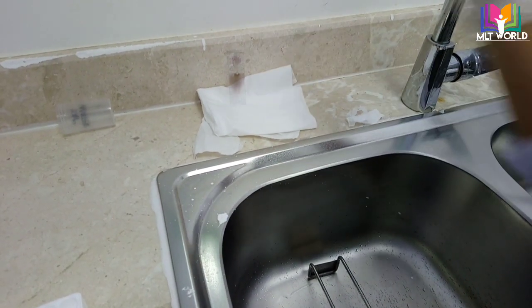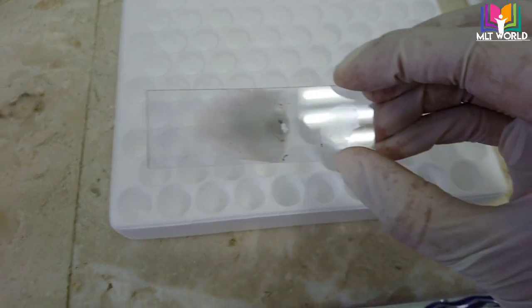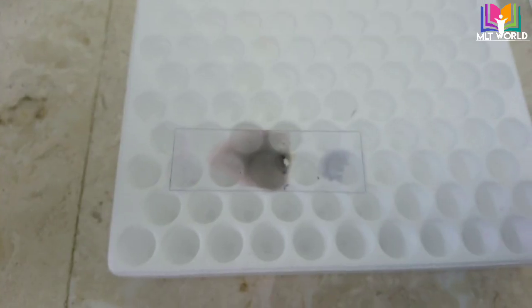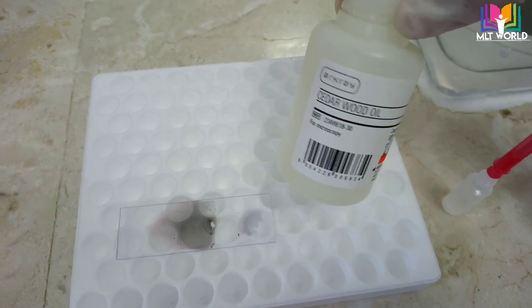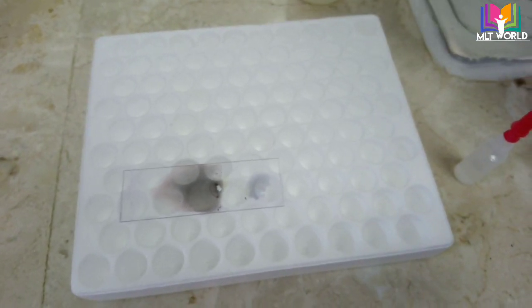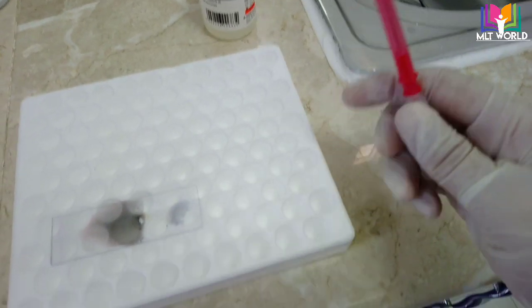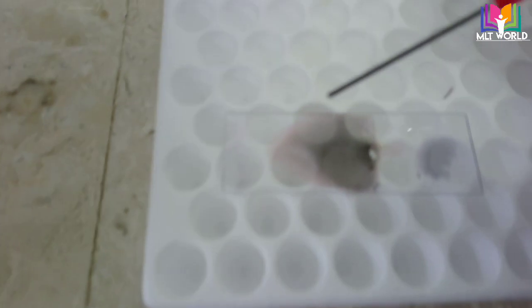When the slide is dry it is ready to read under the microscope. We read the blood smear using the 100x oil immersion lens. For that we will use cedar wood oil, which you can transfer into any small bottle with a dropper — this is an RPR bottle.